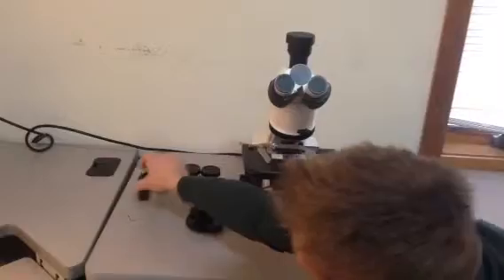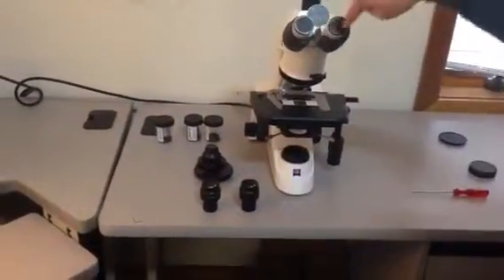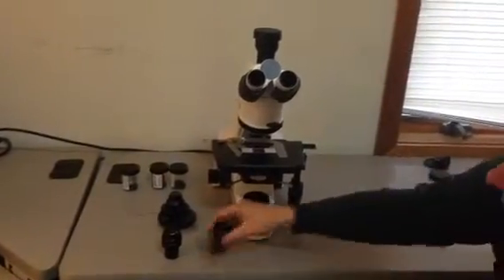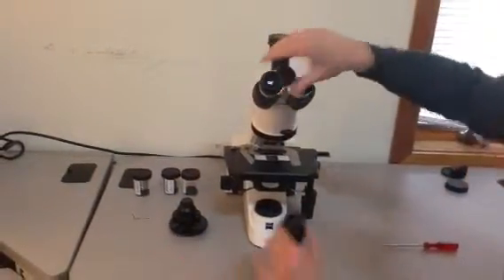Next, you're going to take your two eyepieces and put them into the head. Just pull out these two dust plugs and they slide right in. It should go until it stops.